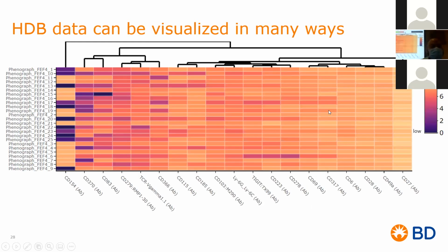And if we see here, we also have dendrograms with our heat map. They're basically breaking up into two major subsets. This is one subset, my high levels expression of CD154, which is associated with activation, if I remember correctly. And then followed into one major subset that gets further broken into two. This region here, and then this whole region, and that gets further broken up into two.